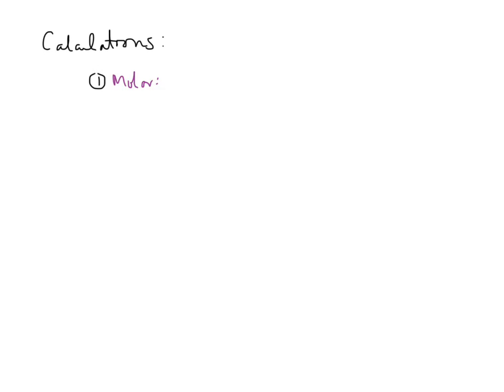Remember it talks about you do have 1 calibration point with water. So if you read item number 6, it says put DI water in it first. Remember don't fill your cuvette too full because it'll spill into the chamber. Kind of wipe down the sides. Make sure your ribs are to the edges, not where your light path is going. Notice number 7, it says the wavelength that we want to go to is 470 nanometers. So make sure you select that.